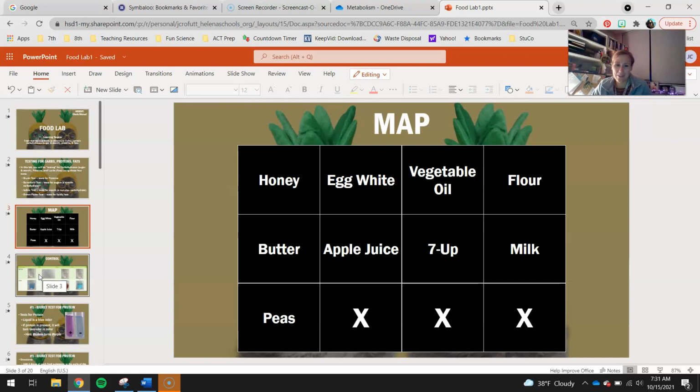So basically, if we know that none of those things are in water, it's going to show us what a negative test looks like. So we're going to have something to compare it to. When I tested milk, it turned this color, but when I tested water, which I know doesn't have any protein in it, this is what it looks like. So what's the difference? I can compare them and say, this is what it should look like if it doesn't have any. What might it look like if it does have some in it?